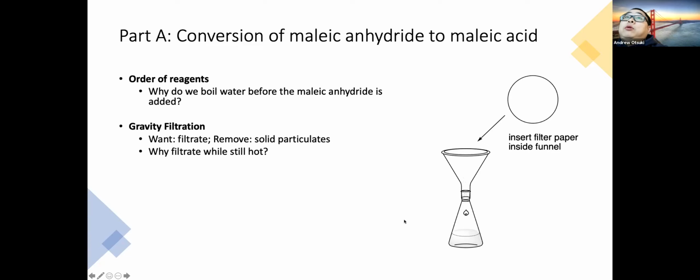And why do we, so this is a filter, but why do we want the filtrate while it's still hot? Does anyone have any ideas? Why do we want the filtrate while it's still hot? Any ideas?